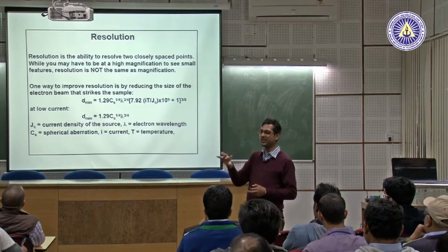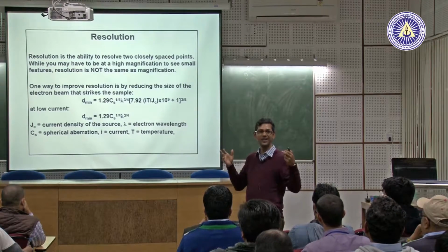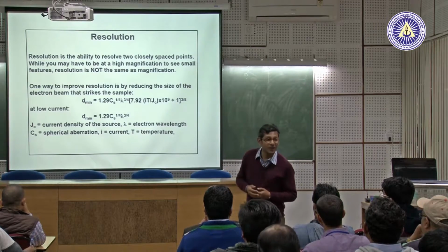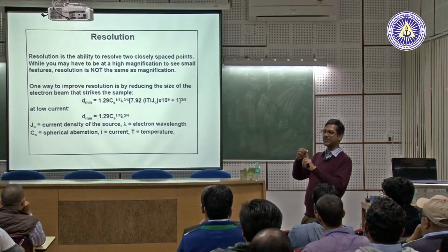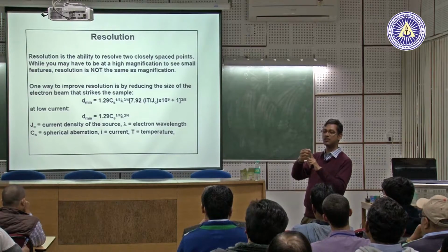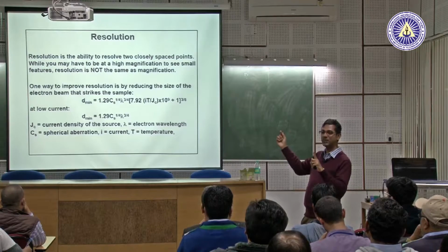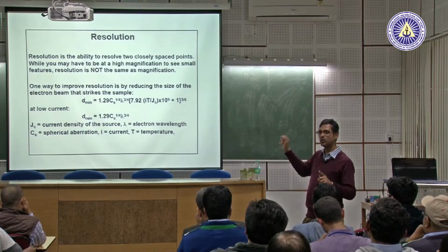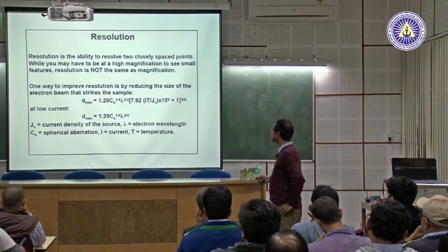But you can't change 0.61 lambda. That's fixed. And I want you to go back to where the 0.61 lambda comes from. Rayleigh's criteria, yes. You have an object here, you want to see an object there. So how will you see? You have two light sources, there are thousands of light sources on this, because this is a very blunt object. Each of them should be separately seen on the image plane, right? So there is overlap. From there it comes. That's the Rayleigh's criteria.